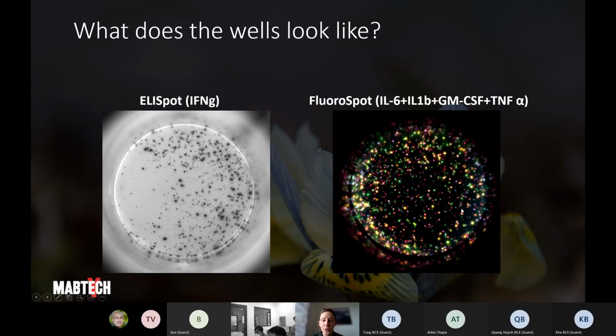If you look at the image, you can see those pure colors in some locations, but you can also see some purple colors and some white colors, and so on. That indicates that you have more than one cytokine being detected at that location. So on Monday, we're going to see how this looks in the software, and what kind of data is presented in the data table based on a profile like this and a profile like this.